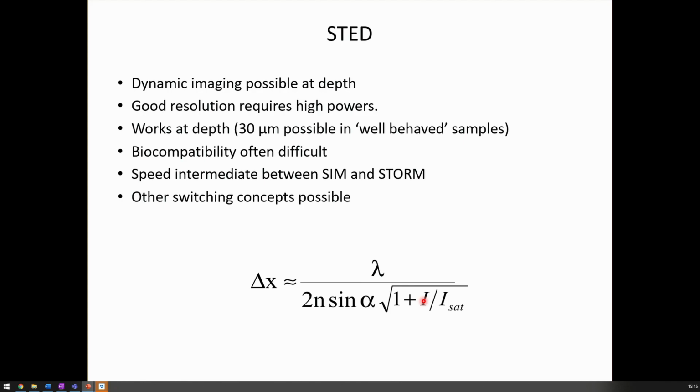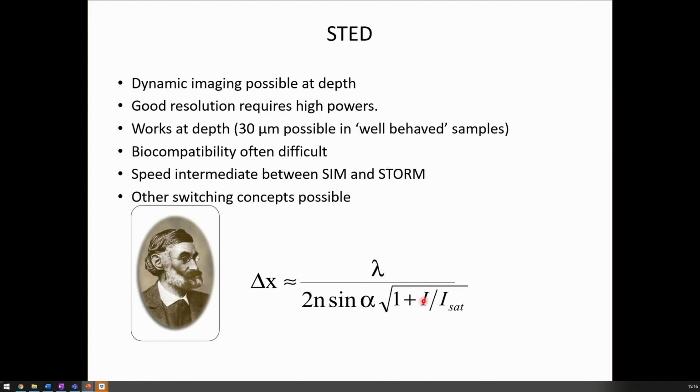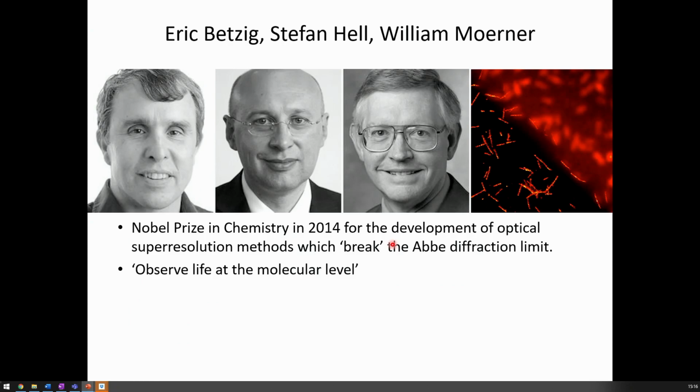And so there are some ideas now to actually reduce the power requirement. If you don't have to use stimulated emission depletion, then perhaps there are other methods that require you to use less power in the depletion beam, because you're switching some other molecular property, color or something else, right? You can think of all kinds of variations. As long as you have a physically distinguishable state in the donut for the molecules you excite, this principle applies. And so actually, the idea behind this is quite ingenious. What you do is you don't break the diffraction limit in that sense. You just find a way to not be limited by it in the standard imaging way by using this physical state switching.